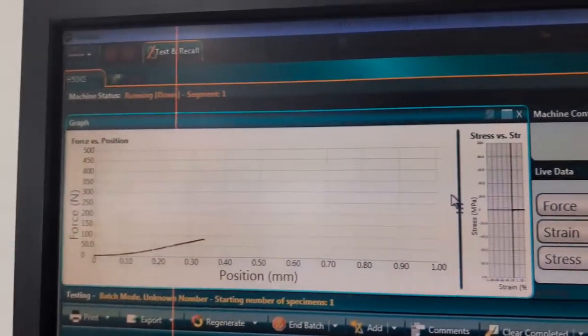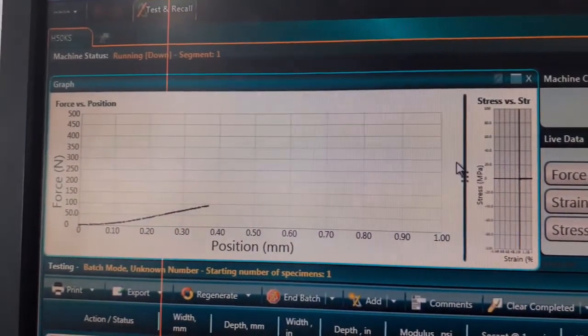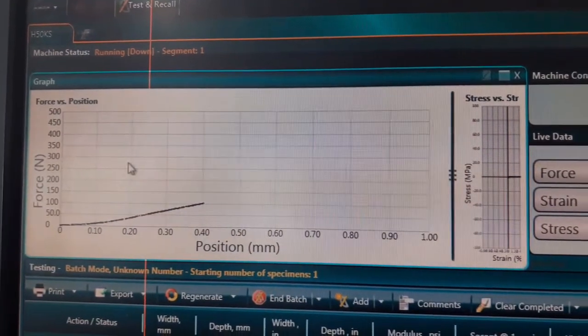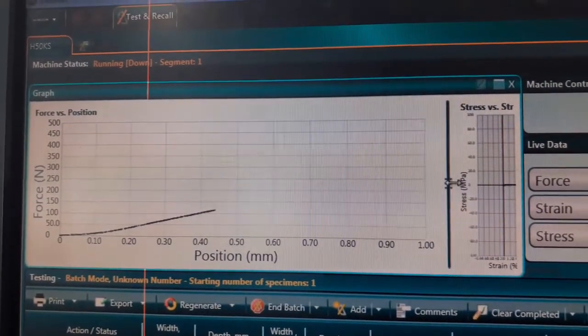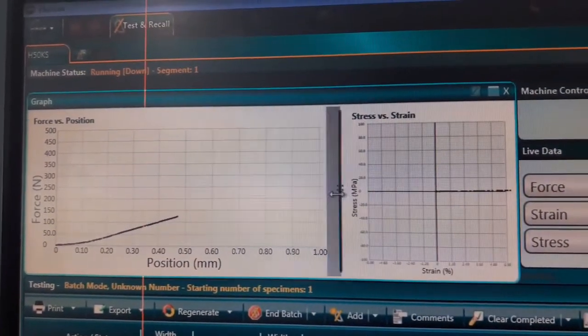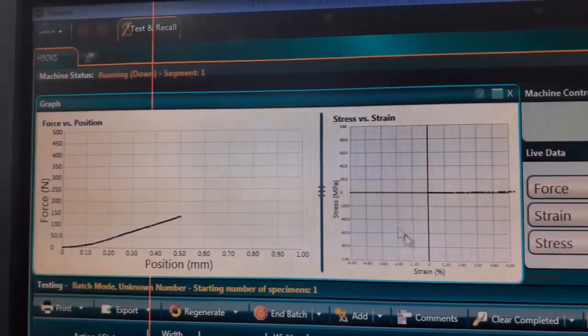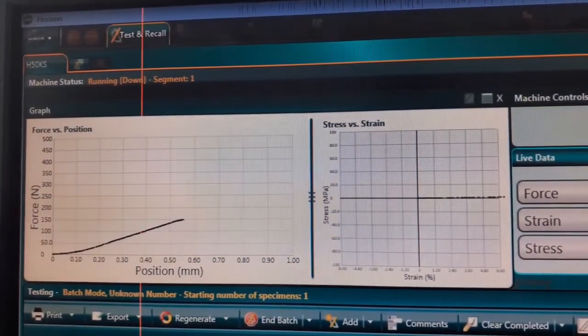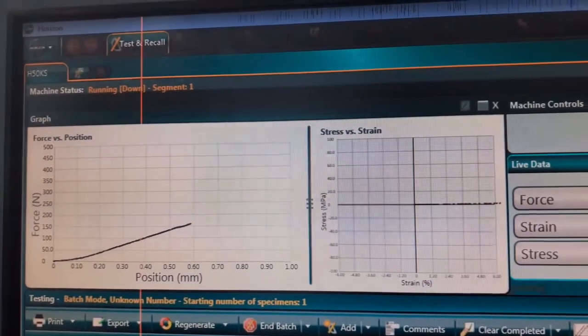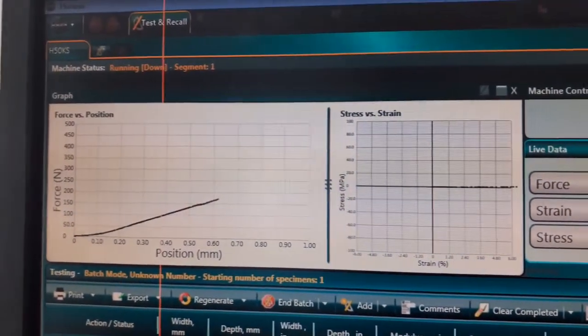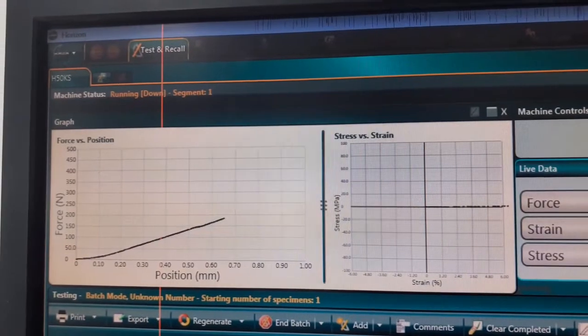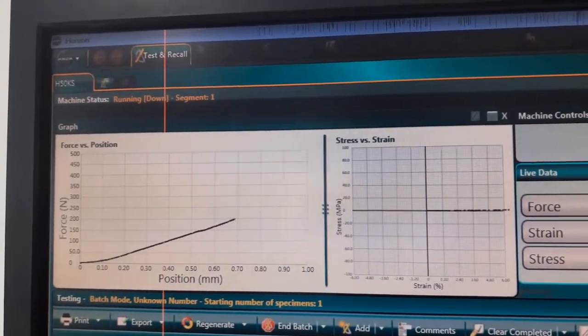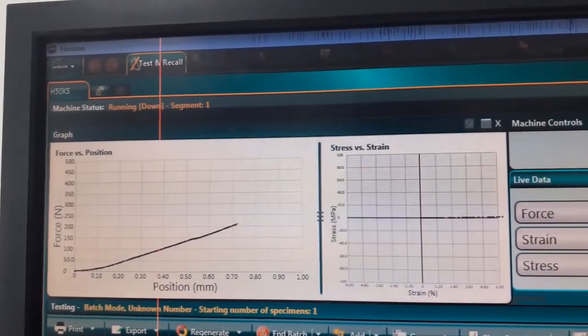Here the force is 150, it's 178, and it's almost 0.70 mm compressed.